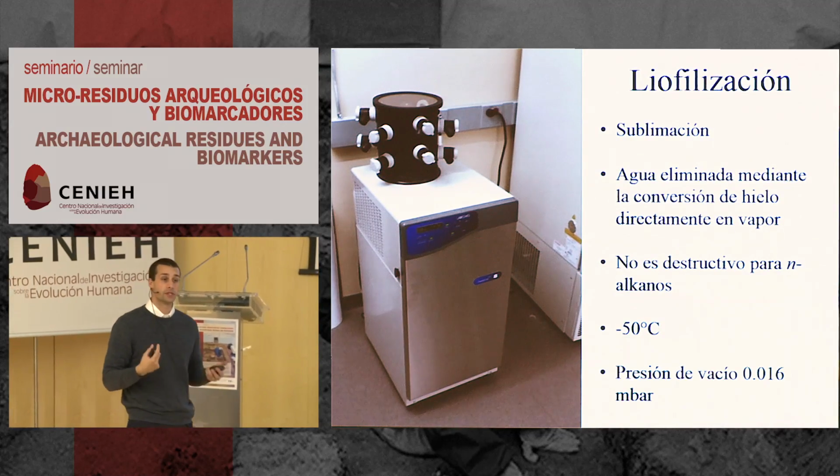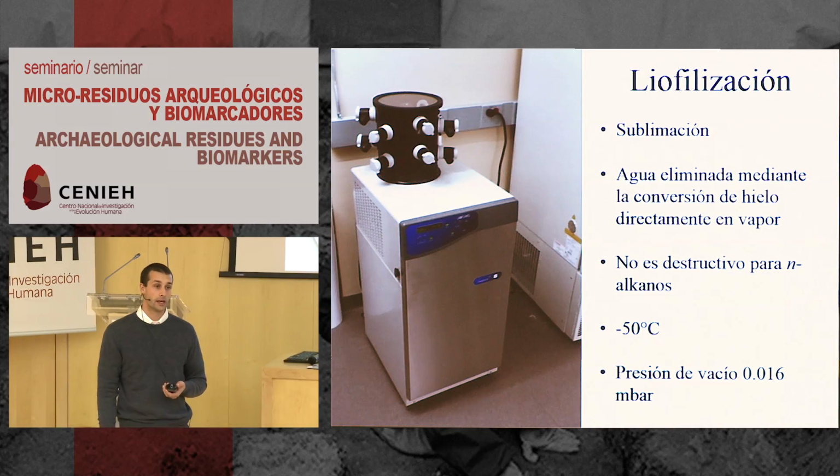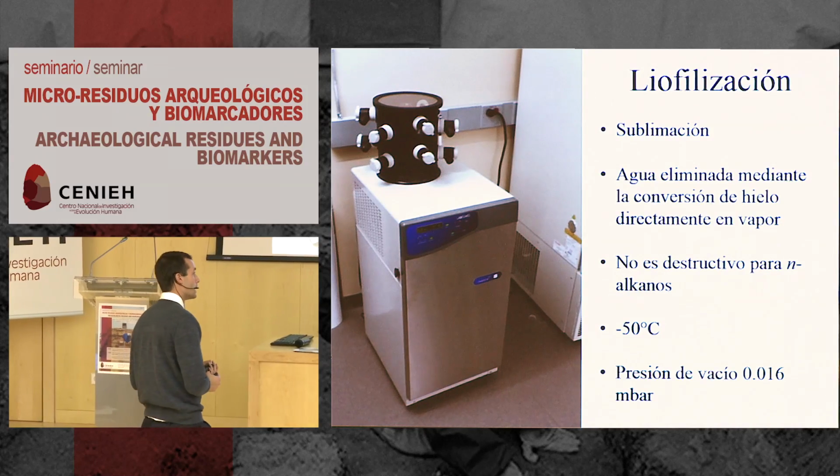It's not destructive, particularly for N-alkanes. I think for some things like starches, it might be a little more destructive, but for N-alkanes and phytoliths, it shouldn't really cause any problem when doing this.